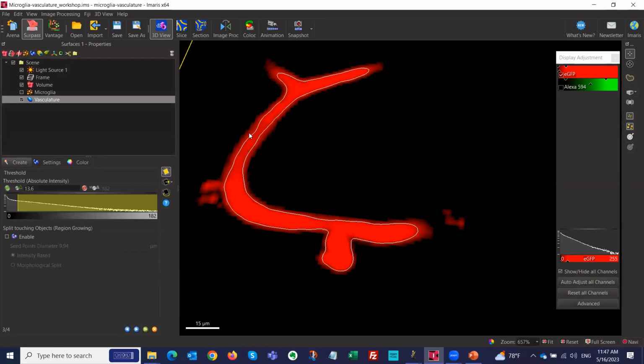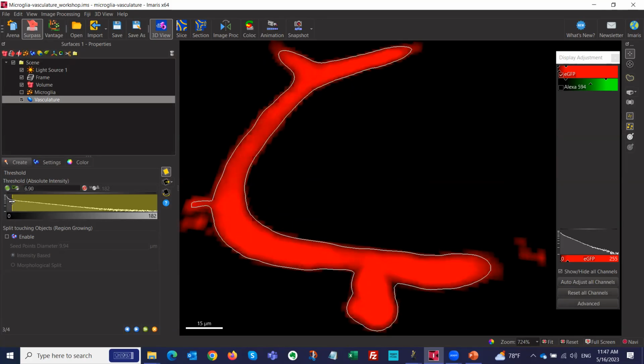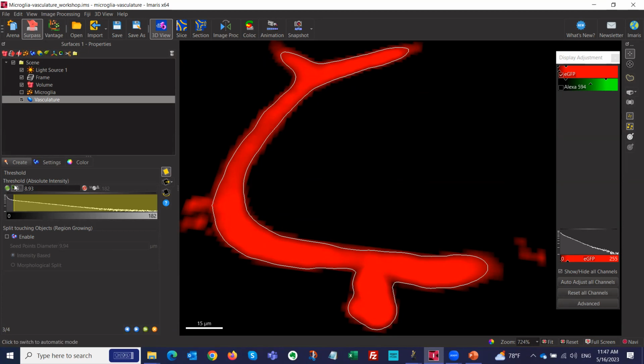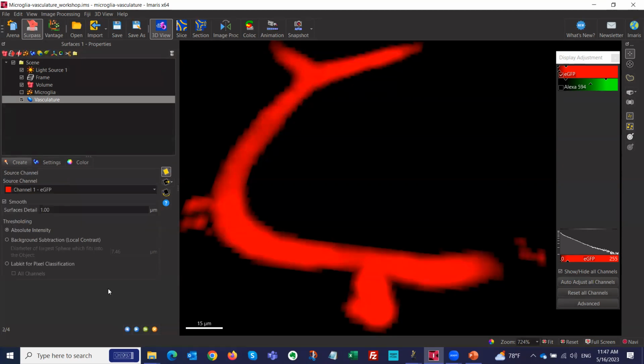It gets a little bit more under segmented here. You see that? I can go with a slider here and adjust the threshold, no problem. And the result is good, it will look good and is good, but you may have done 7.7 and maybe your neighbor has done 8.93 or something. So there is a human bias component that comes into it. That's why, again, remember, I try to avoid it. I try to go with the automated and see if maybe I can do a different one.